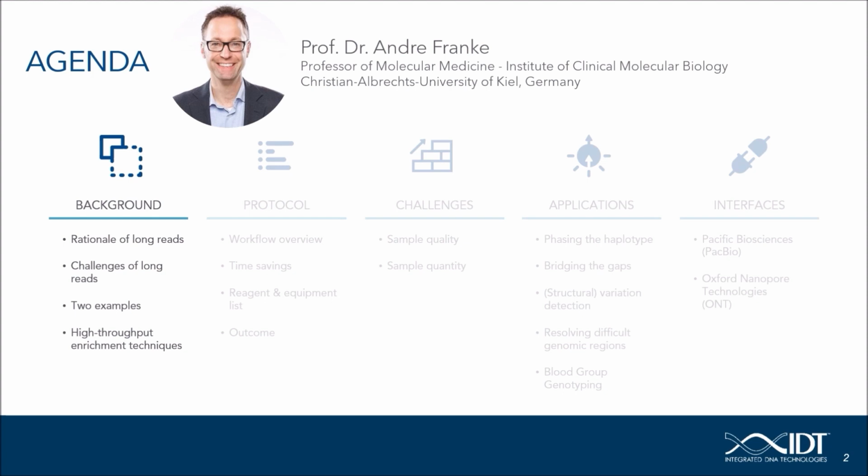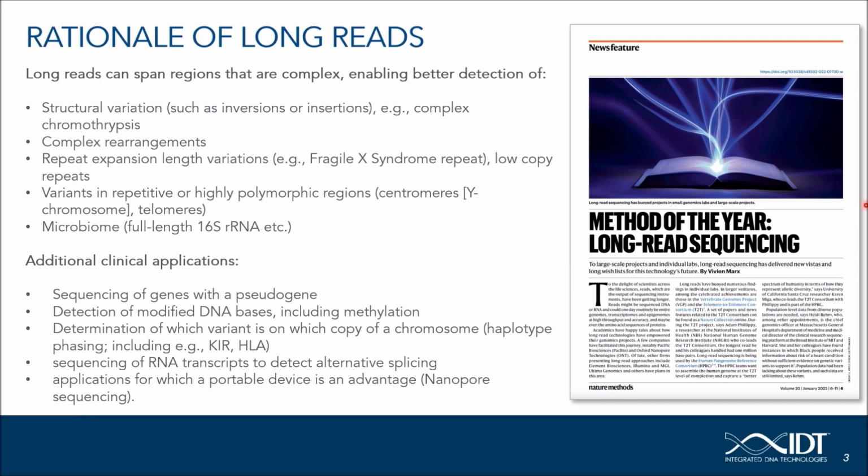So as announced, we want to present to you today a method for targeted enrichment of long fragments for long-read sequencing. But before Tim will walk you through the method and the details of the protocol, I wanted to give you some background on the rationale of long-read sequencing. I also wanted to outline some challenges that you may have with long-read sequencing, and I want to give you two examples. Long-read sequencing has been titled Method of the Year by Nature Methods in this year's January issue.